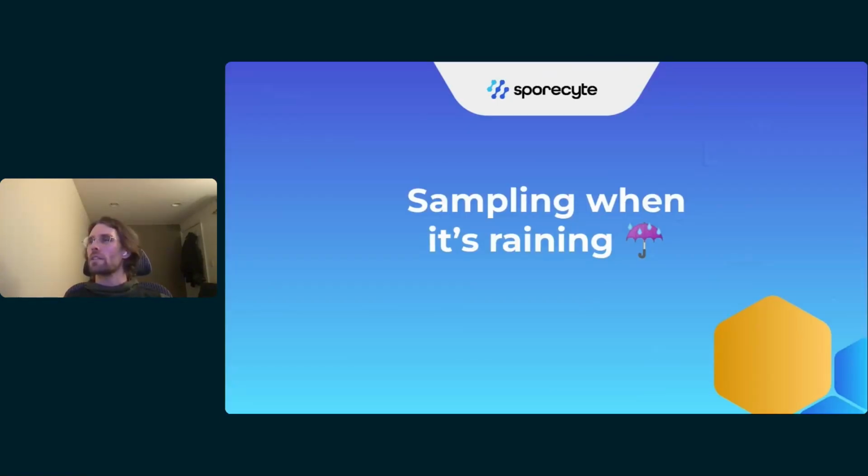So, sampling when it's raining, this is a hot topic. I'll say a lot of my stance on this comes from Dr. Harriet Burge, who is really a pioneer in mold assessment in our industry of mold testing. She used to have a column called Ask Dr. Burge, and she has a really good column from 2009 where she discusses sampling in rain and snowy conditions.